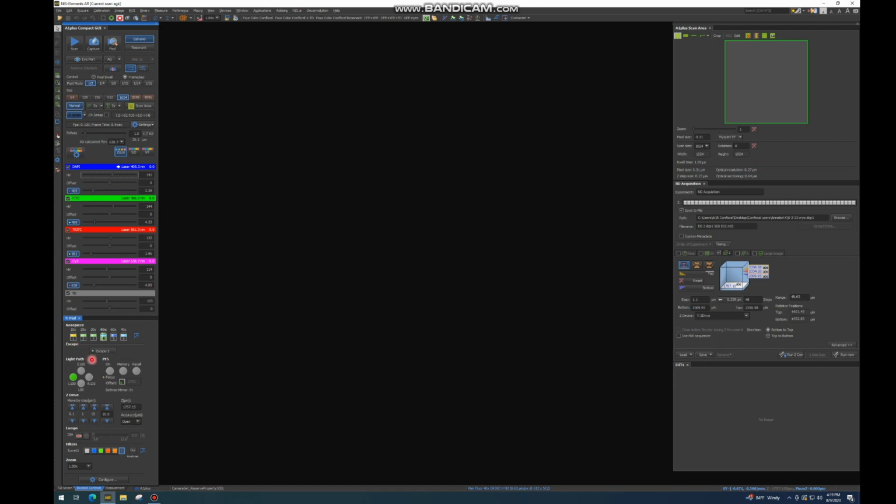Down here, you get into light path. We have 2 light paths. We've got E100 and L100. So E100 tells you what path the light is taking, and E100 is the path of the eyepiece, meaning that light is going through the eye port, and there will be no laser light being used. L100 means that the interlock is on, so there's no light coming through the eyepiece because the lasers are on, and this is telling you that the light is taking the path of the lasers. This should change automatically when you click between eye port and scan, but if it doesn't and the lasers aren't coming on or you can't see anything through the eye port, you might manually need to click it.